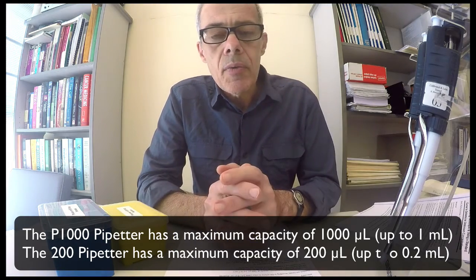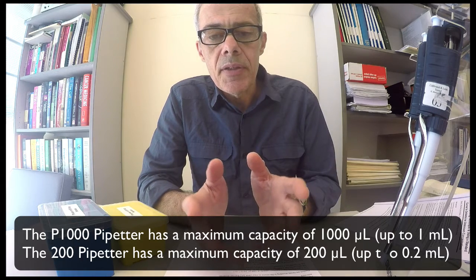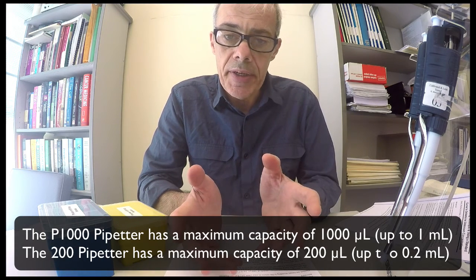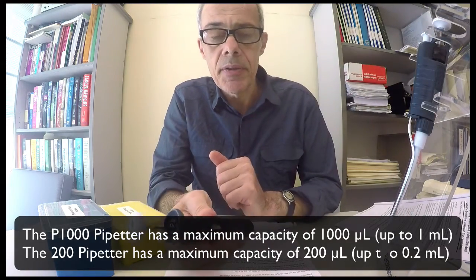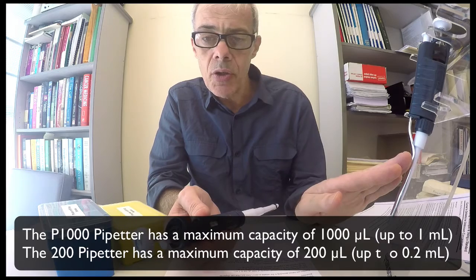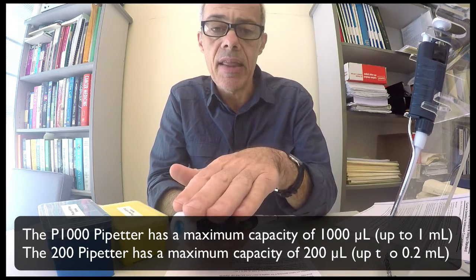So let's assume I want to dispense a volume of say 800 microlitres. Clearly I'm going to be using a P1000 because it's greater than 200 microlitres and it's less than a thousand microlitres.